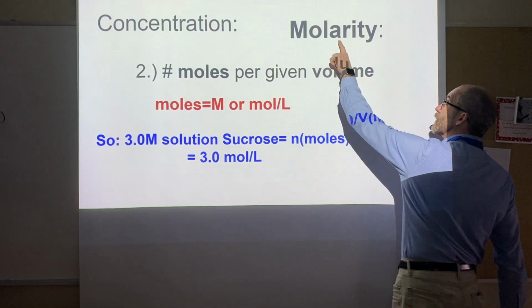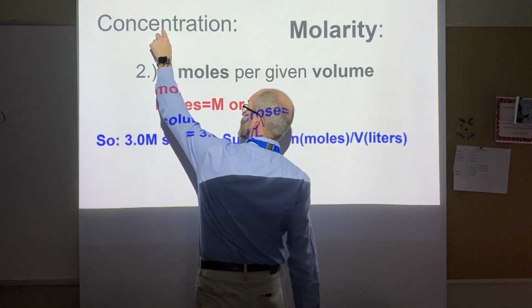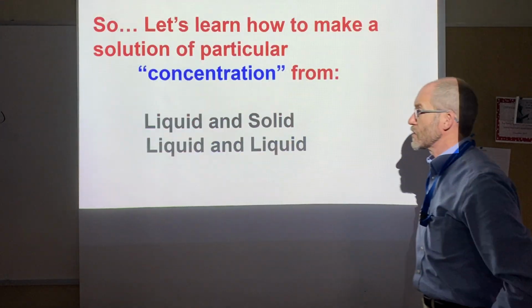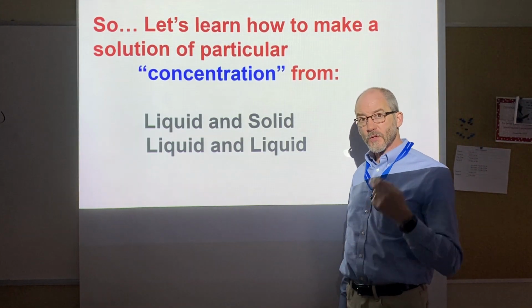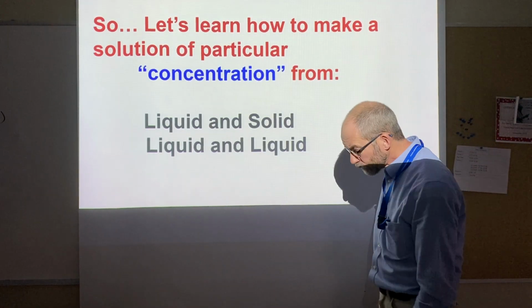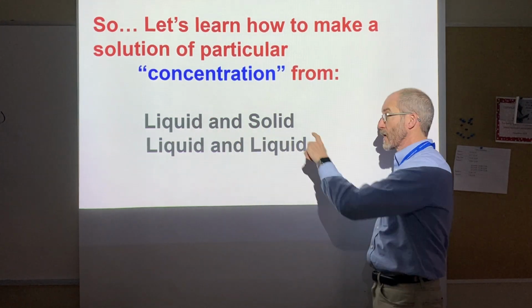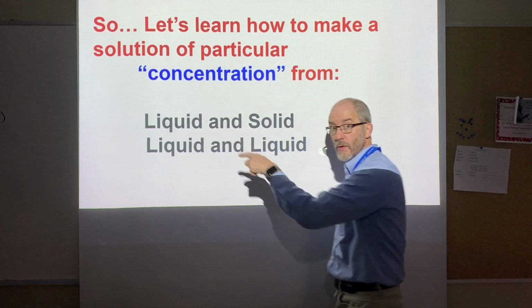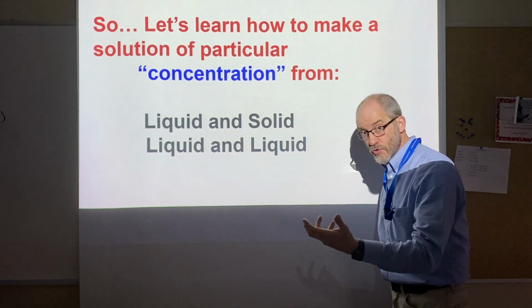Okay, so we're going to begin with molarity. And what is molarity? It's a way of expressing concentration. So what I want us to do is make 2 solutions together. We're going to make a solution from a liquid and a solid. In other words, we're going to take a solid, put it in the liquid, right? And we're going to make a certain molar concentration.